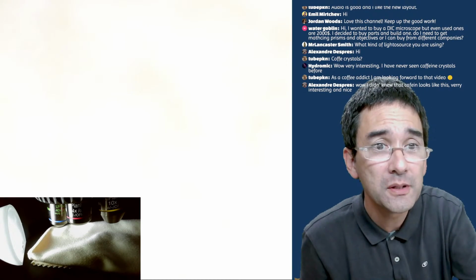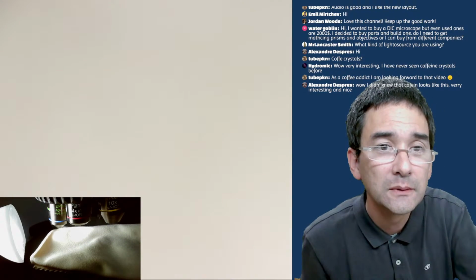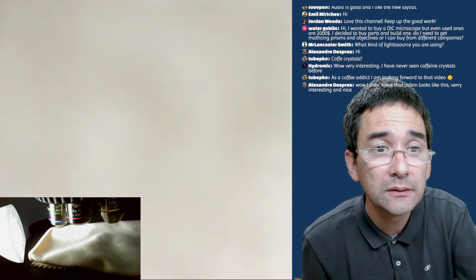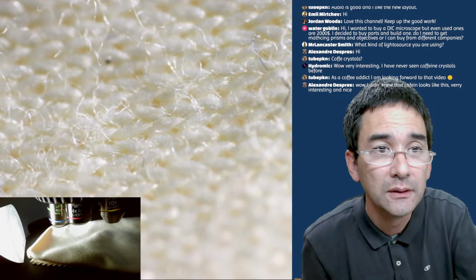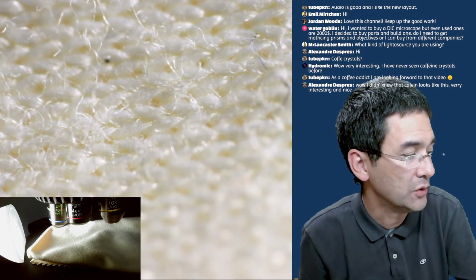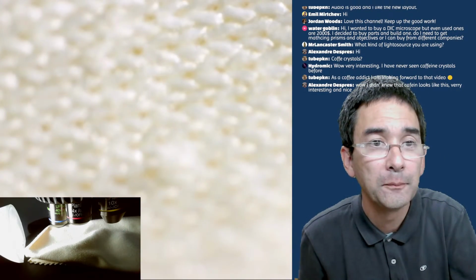That's one of the problems if the thickness is not right, or maybe it's too bright. See, the contrast is a little bit low. Here we go. You can see the surface texture, and all of the dust and the dirt that is found on the microfiber cloth.